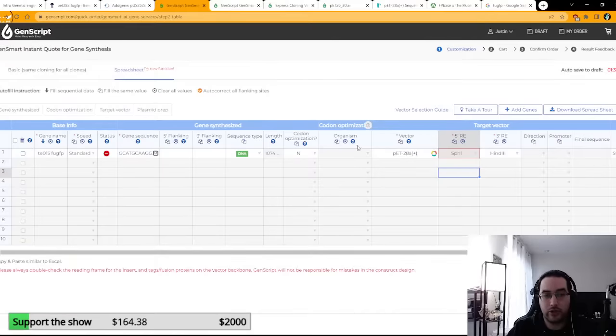So you're going to have to futz with their tool a little bit. Make sure that it detects the right enzymes. Make sure you're pasting it in correctly. The last thing I want to talk about, and then we're basically done for the day, and I'm going to do questions and then call it.